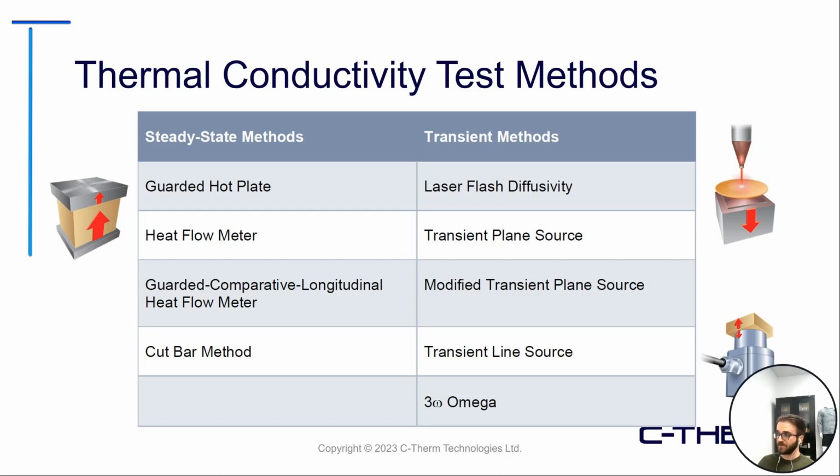Now, as Adam mentioned, there's a range of different test methods out there for thermal conductivity characterization. Again, I won't be spending too much time on this, but I did just want to give a little bit of background information on some of the different methods that are out there and how they are applied, kind of what types of materials they're really geared towards.